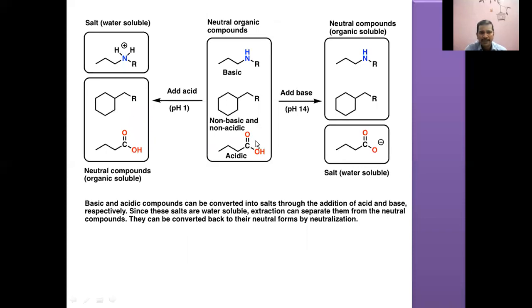So this is a general chart I am going to present. You take the compounds which are basic, acidic, and neither basic nor acidic. They are neutral. How to introduce the separation? If you take the mixture of these 3 groups of compounds and add base, that is, you raise the pH of the solution greater than 13, up to 14, neutral compounds will be left as such, because the base will not react with neutral compounds.